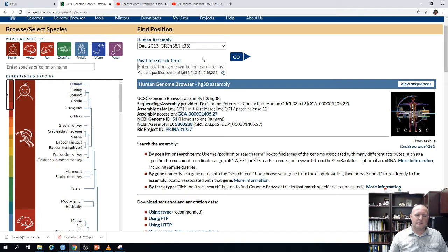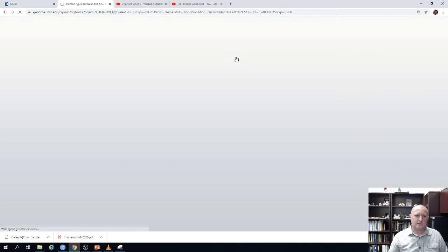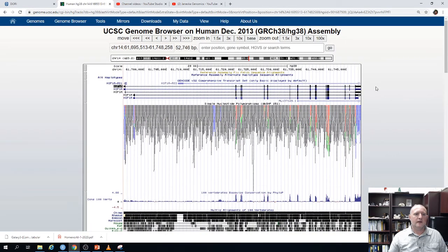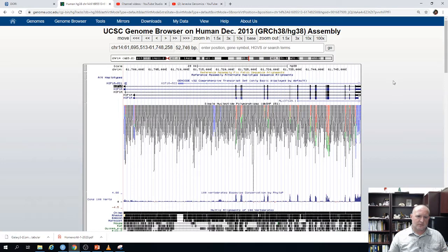Currently, the most up-to-date human assembly is HG38, and it was made available in 2013. We're going to hit Go — that will take us to the viewer. The viewer shows you a specific region of a chromosome. At the very top you have the name of the genome and the assembly version.